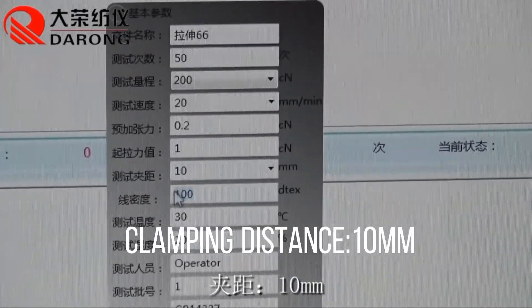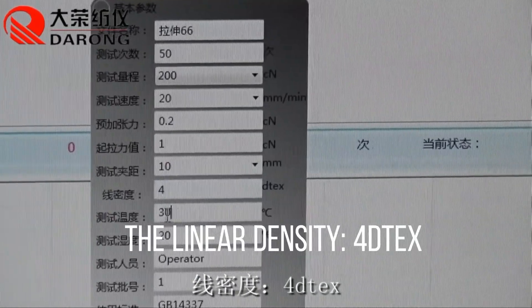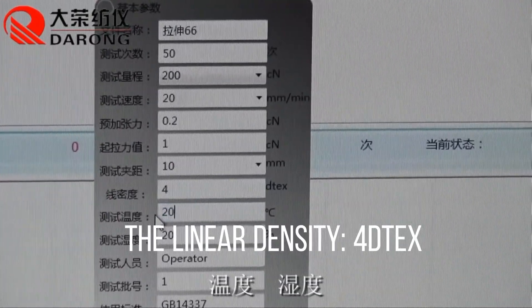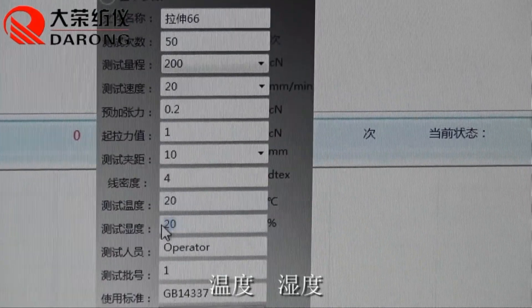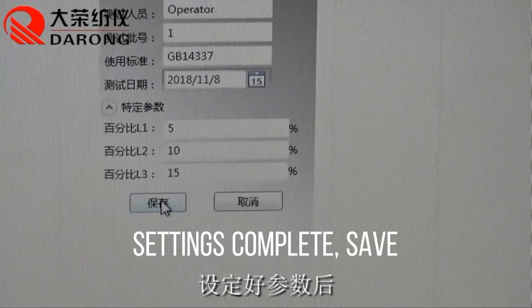Clamping distance: 10 mm. Linear density: 4 dtex. Settings are complete. Save the configuration.